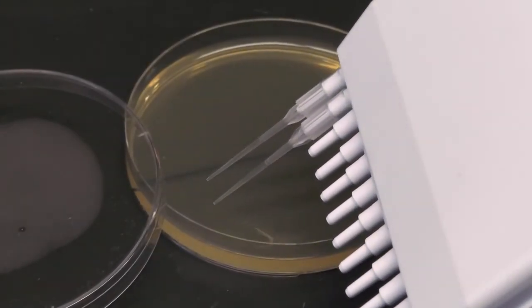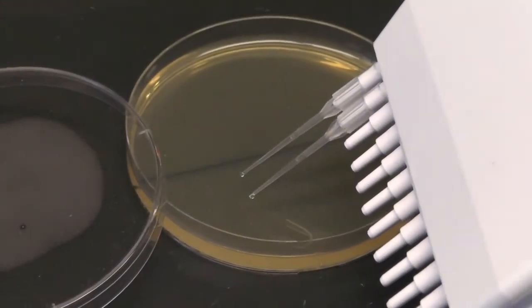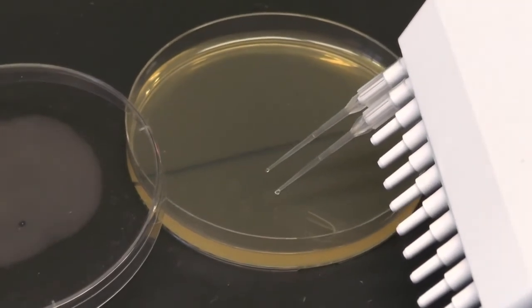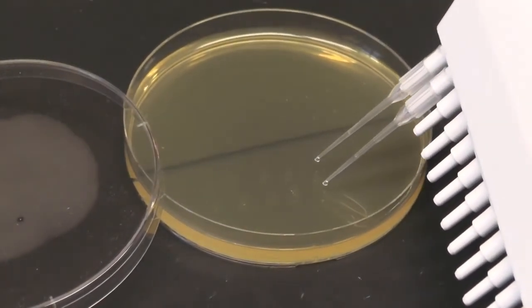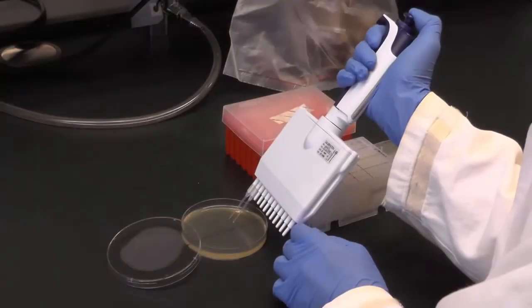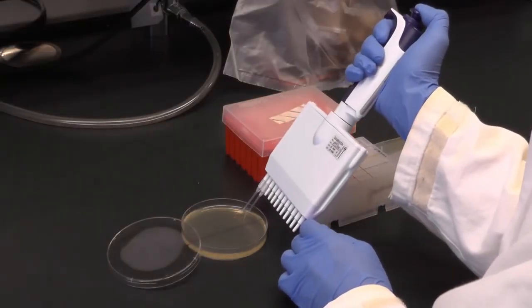With the tips touching the agar slightly, press the plunger button lightly to release small droplets of sample onto one half of the agar plate. Continue dispensing in a straight line until the 10 microliters of sample is all plated.